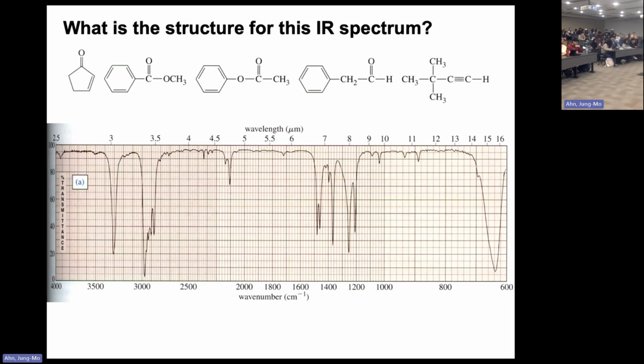And then you've got no carbonyl, nothing there. All of the other molecules have a carbonyl. So there's a 1700 region, right? That's at 1700, and you've got nothing there. So that has to be this one. So it's kind of a way to narrow things down. That's basically what was talked about. There's a triple bond there, and you've got no carbonyl. So I think none of these four, but only this one can make this IR spectrum. So I think that's probably the simple one.